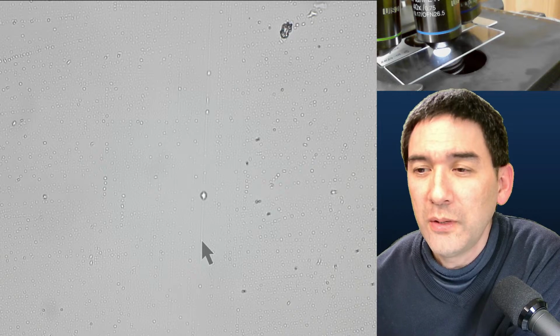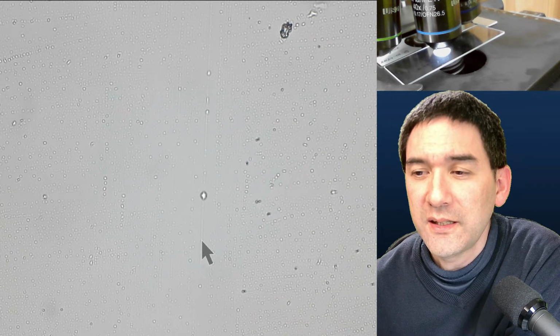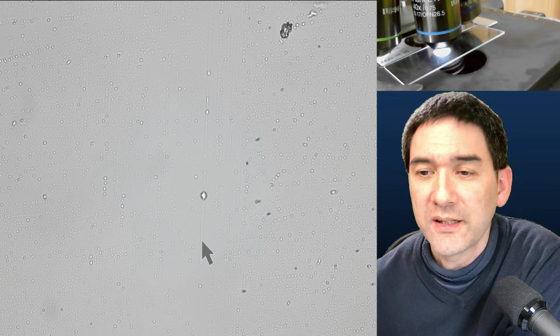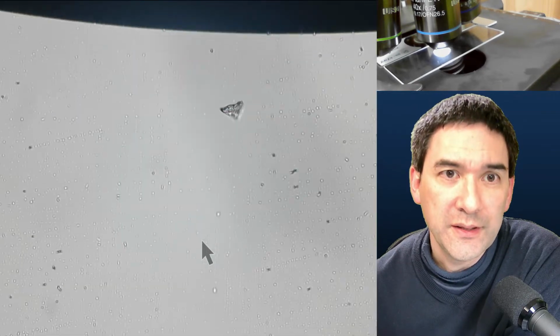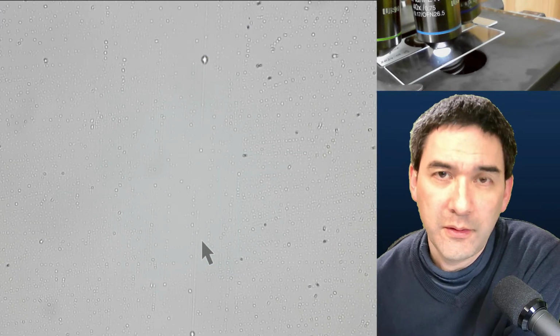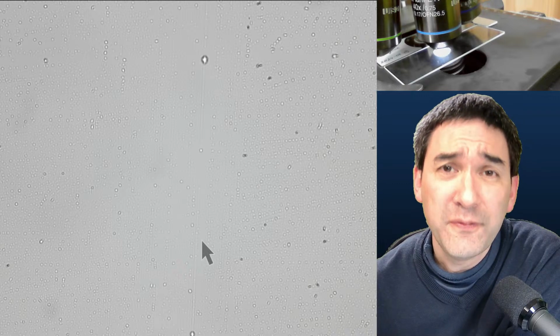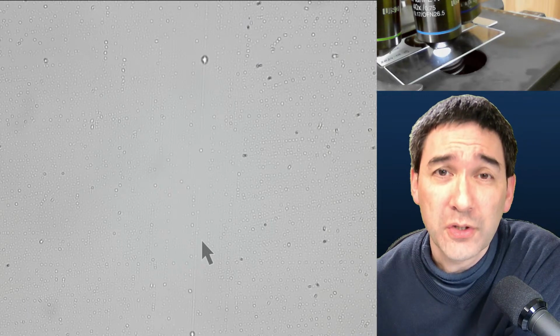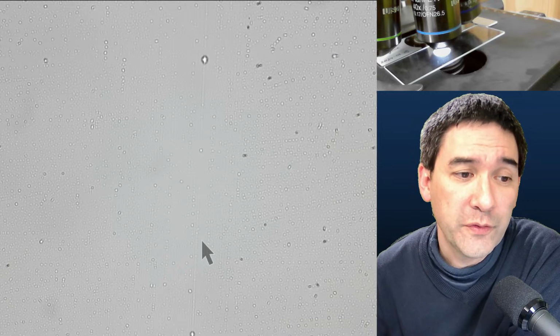I think I do have a measuring device in the camera software. It gives the distance in micrometers as I draw lines on the screen. Yes, that is correct. However, you have to calibrate this. Generally, it is also possible to calculate the approximate magnification, but this is difficult because you have to include the magnification of the camera optics and all of these things as well.